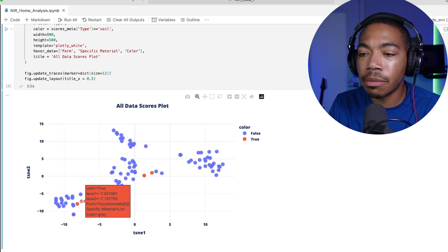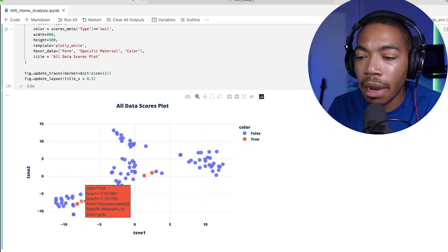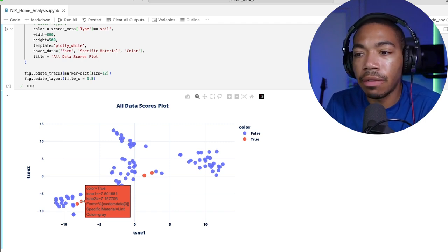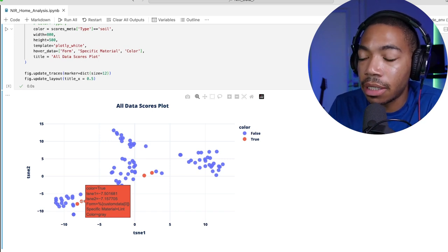So we can see that as these materials go in the dryer and those particles are removed from the fabrics and collected on the trap, the actual chemical composition is very similar to that of the cottons and other clothing that were included in this study.